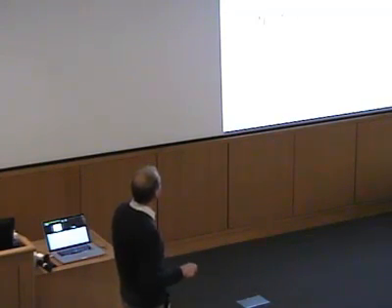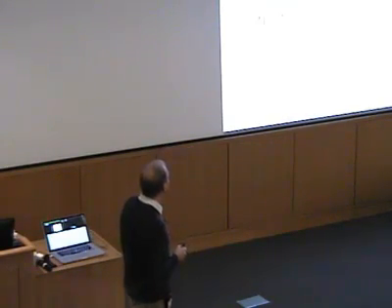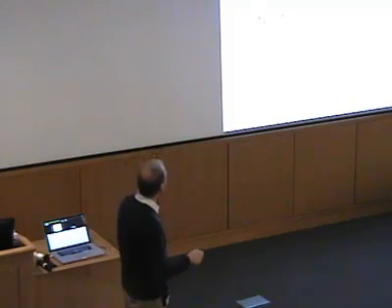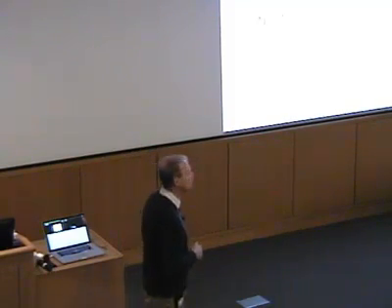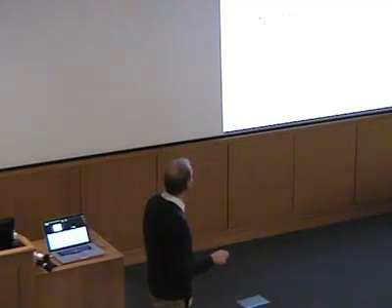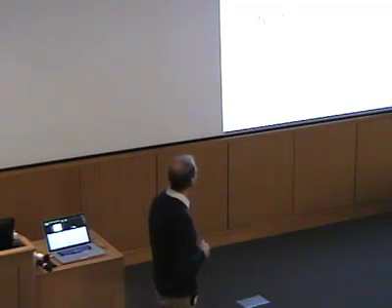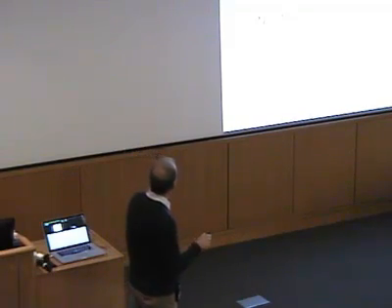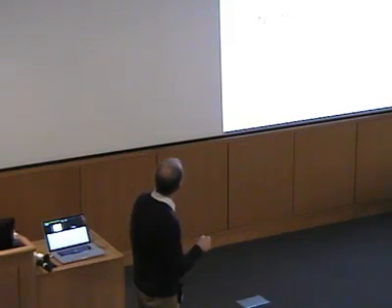So what I would see then, if I had say a free radical in solution where I just had my unpaired electron and there was some single nucleus nearby that it was coupled to, if that nucleus was a proton, then my spectrum would split into 2 lines with a separation A. If it was a spin 1, I would get 3 lines, and so on. And so depending on what the spin of the nucleus is, I get 2I plus 1 lines, where I is the spin of the nucleus.